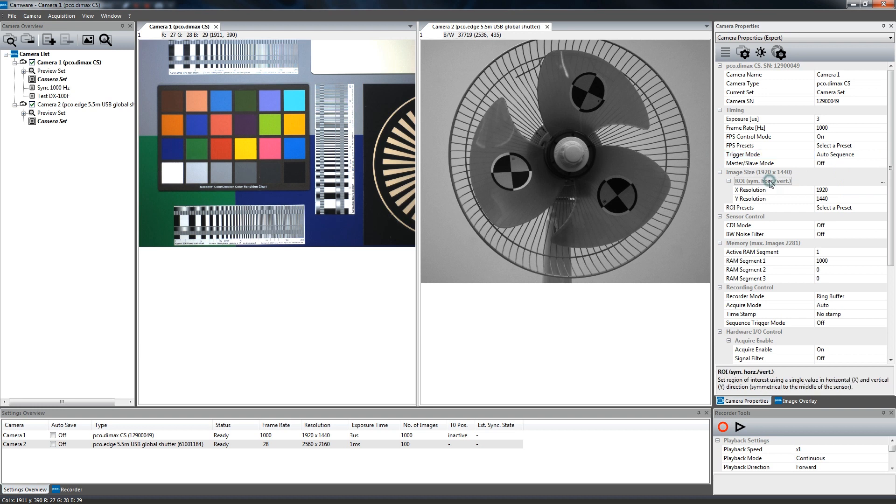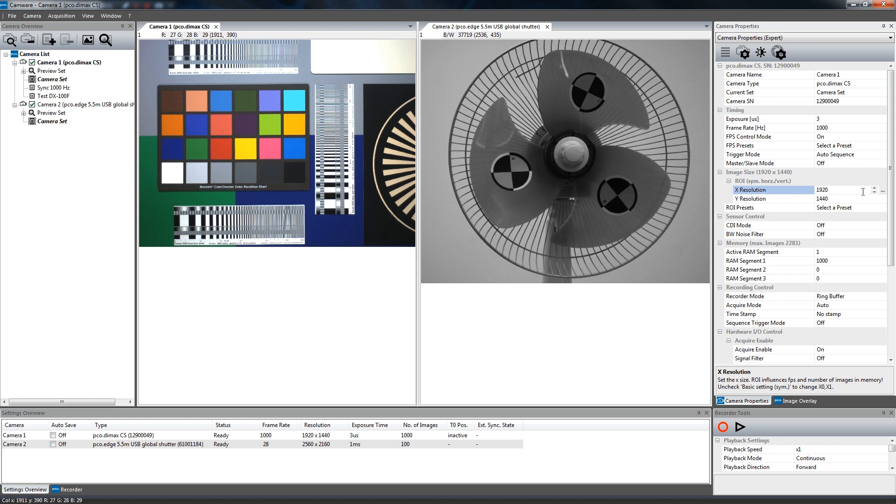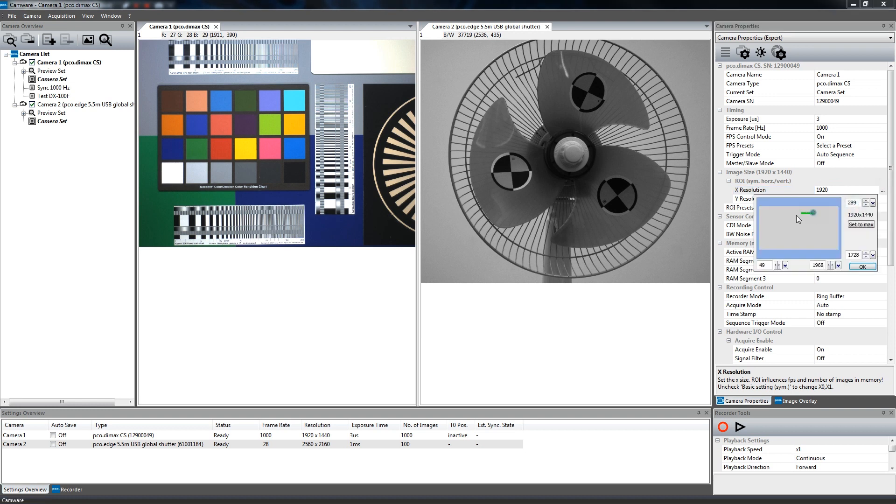The ROI, which stands for region of interest, selects a part of the sensor to be read out, thus reducing the amount of image data and potentially increasing the frame rate. Enter the ROI values manually or open the ROI window and drag a ROI by mouse.